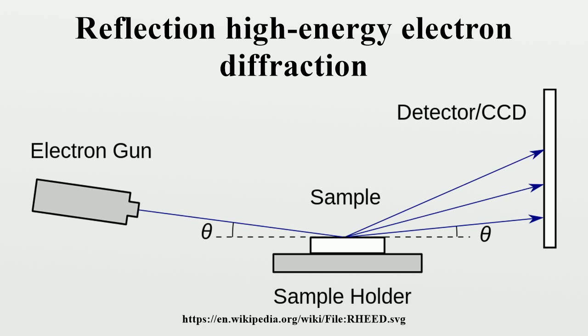In practice, RHEED systems are operated under ultra-high vacuums. The chamber pressure is minimized as much as possible in order to optimize the process. The vacuum conditions limit the types of materials and processes that can be monitored in situ with RHEED.